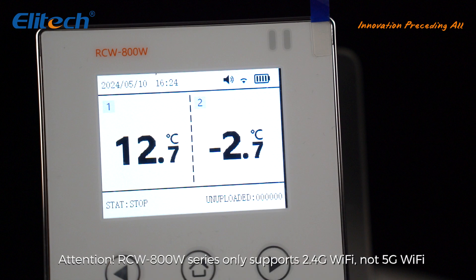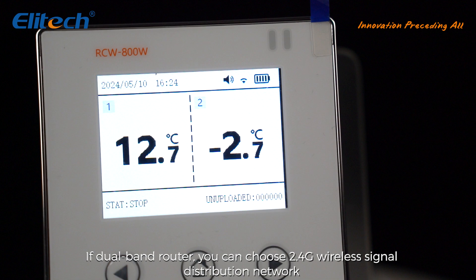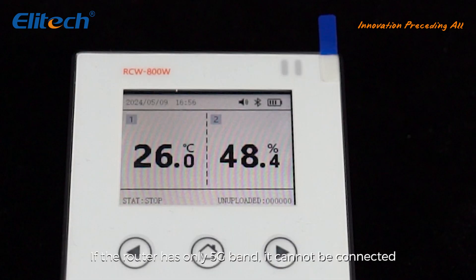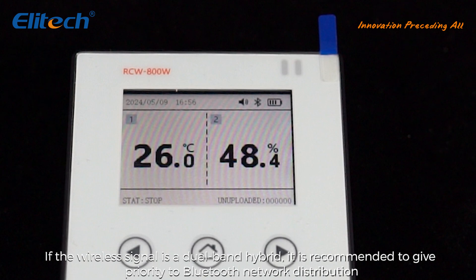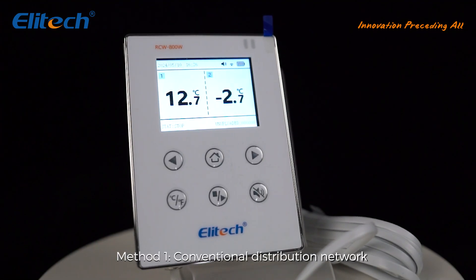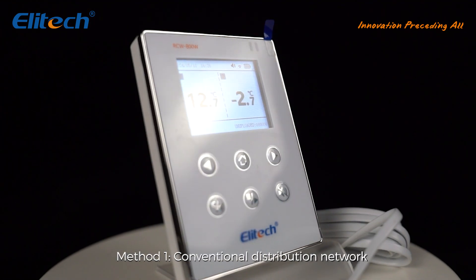Note: the RCW 800W series only supports 2.4G Wi-Fi, not 5G Wi-Fi. If using a dual-band router, choose the 2.4G wireless signal for network distribution. If the router has only a 5G band, it cannot be connected. If the wireless signal is a dual-band hybrid, it is recommended to use the Bluetooth network distribution method.